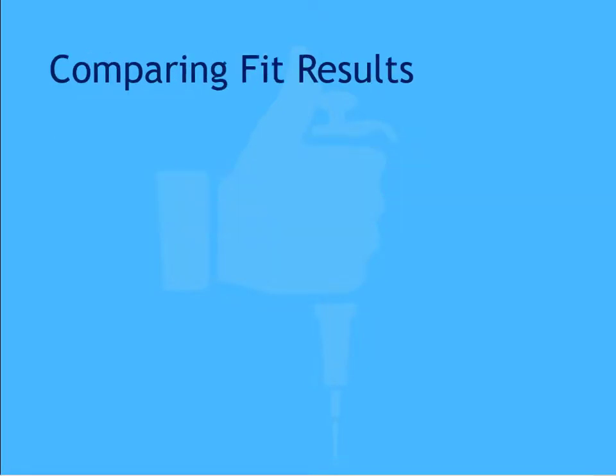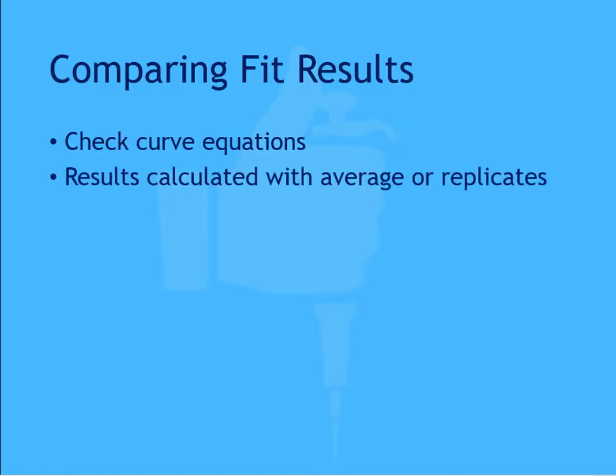Other factors to consider when comparing results with other systems include checking that the equation of the curves are the same, as in some cases different vendors will use different forms. Also check that the same data is used. One may use replicated values and another averages.